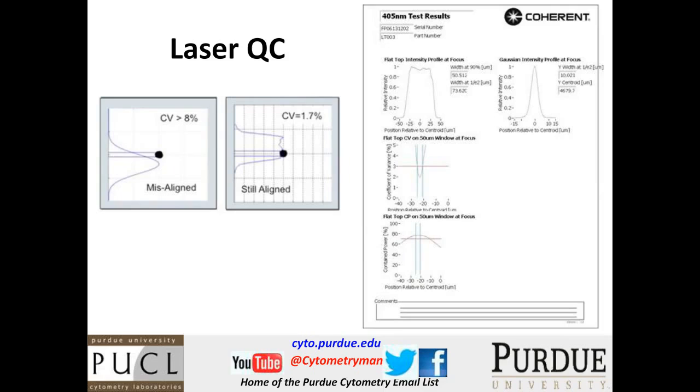There's an advantage in this because, as you know, we often broaden the laser out a little bit so that when a cell goes through the laser beam, it gets an equal amount of intensity. We don't like having the intensity of the laser beam, which of course is the strongest right here, but it falls off exponentially as it goes down here.